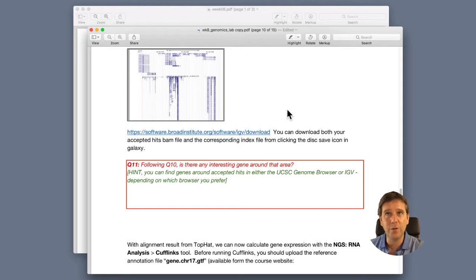The Galaxy server will be available for as long as we have credit in our Amazon Web Services account. It costs around $50 a day or something like that at the minute per student. So we'll see how long we can keep funding that. It should be available until about Tuesday of next week, I'm imagining. And after that, you can use the free Galaxy server, usegalaxy.org, to do some of this work.